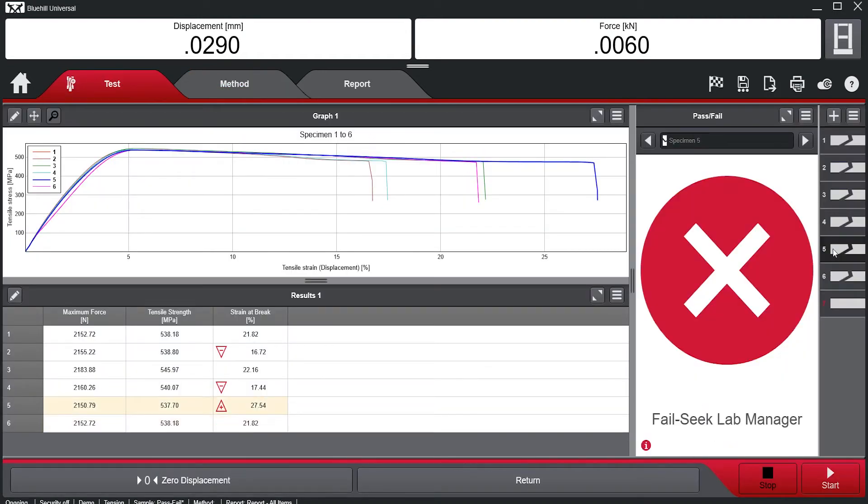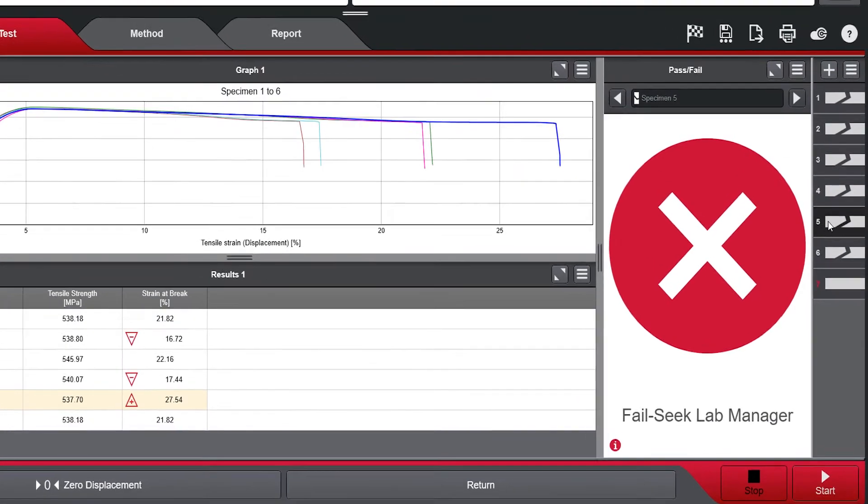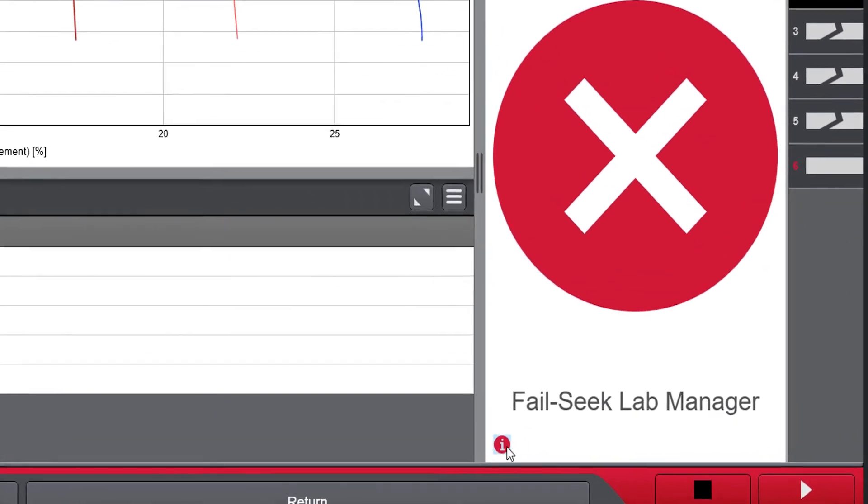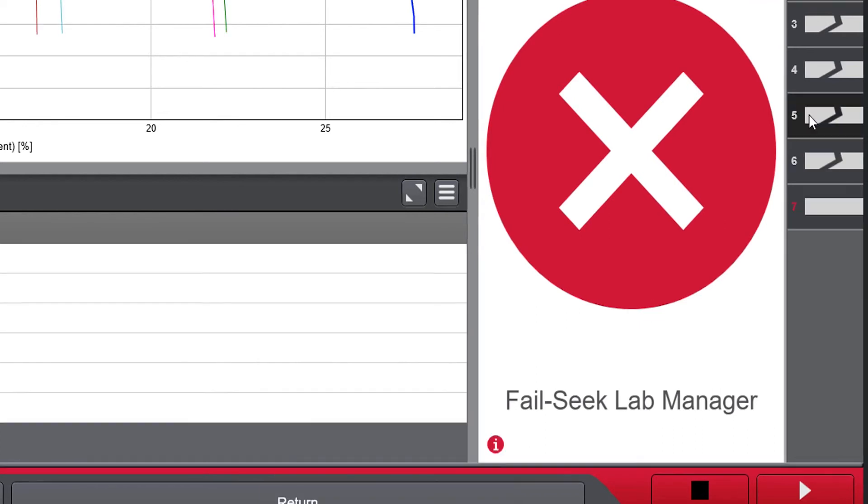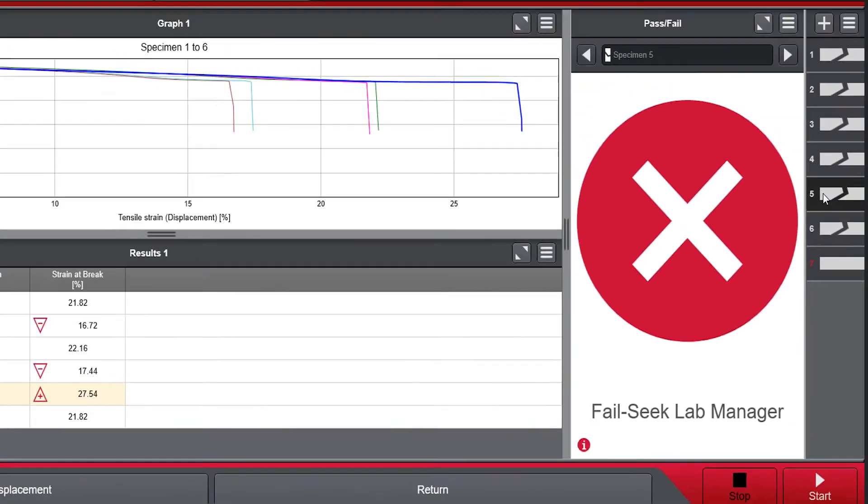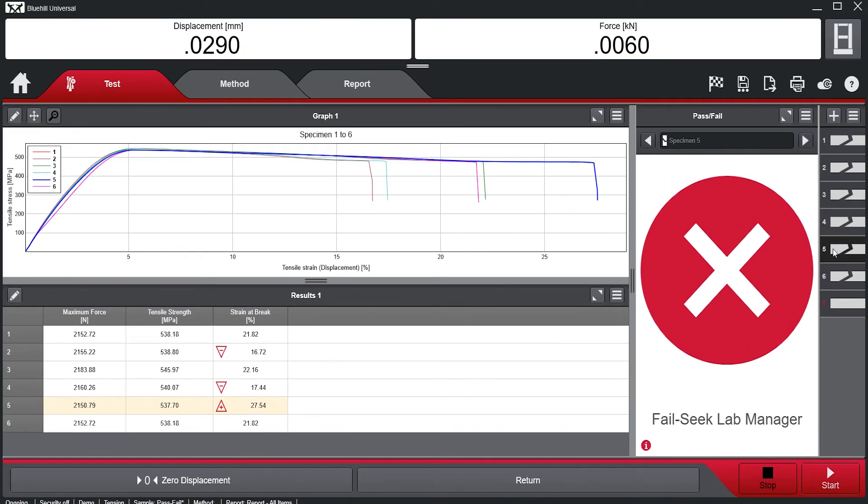Additionally, by clicking the information icon in the Pass-Fail module, the operator can see specifically why the specimen failed. Pass-Fail in Blue Hill Universal is intended to simplify the quality control workflow, minimizing errors and maximizing confidence in the data.